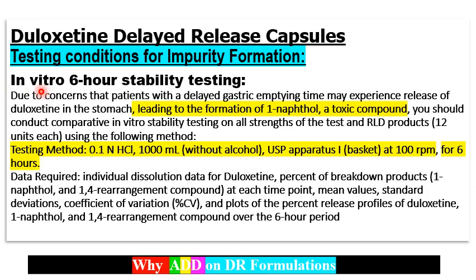Then the test 2, in vitro 6-hour stability testing. This is a somewhat different requirement for this formulation due to the concern that patients with delayed gastric emptying time may experience release of duloxetine in the stomach, leading to the formation of 1 naphthol, a toxic compound.